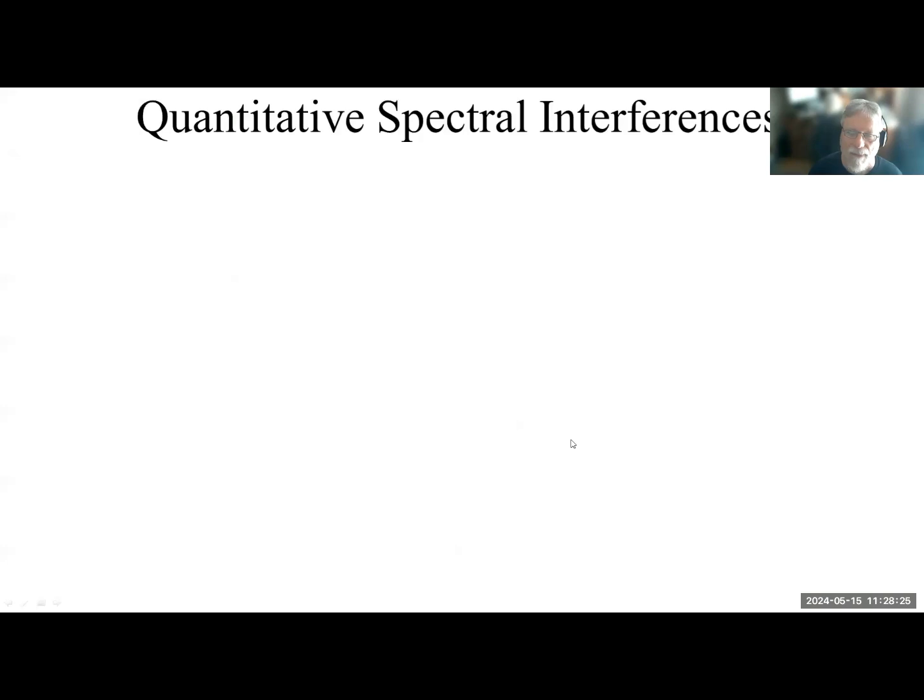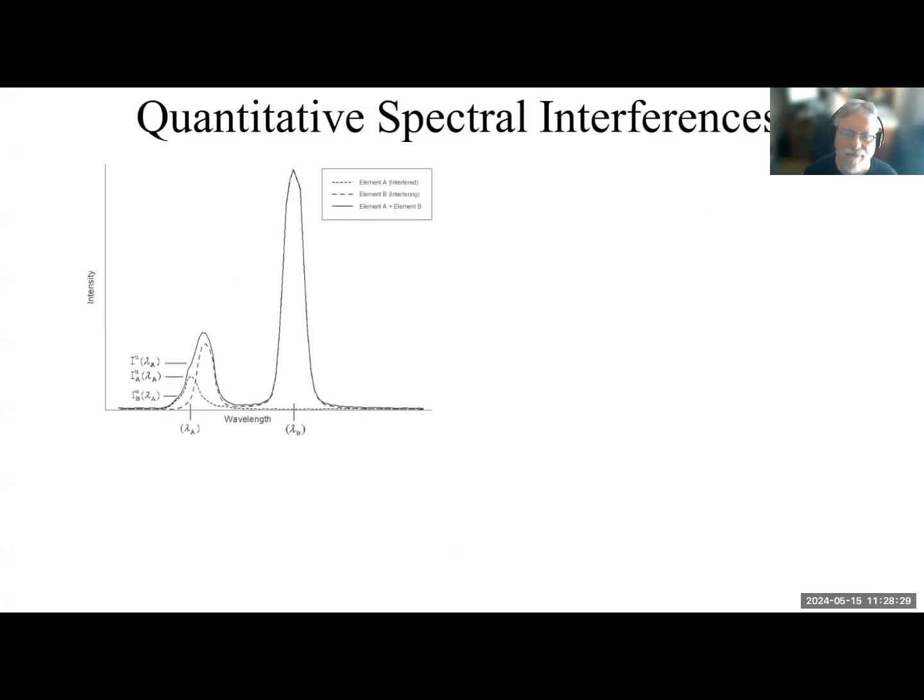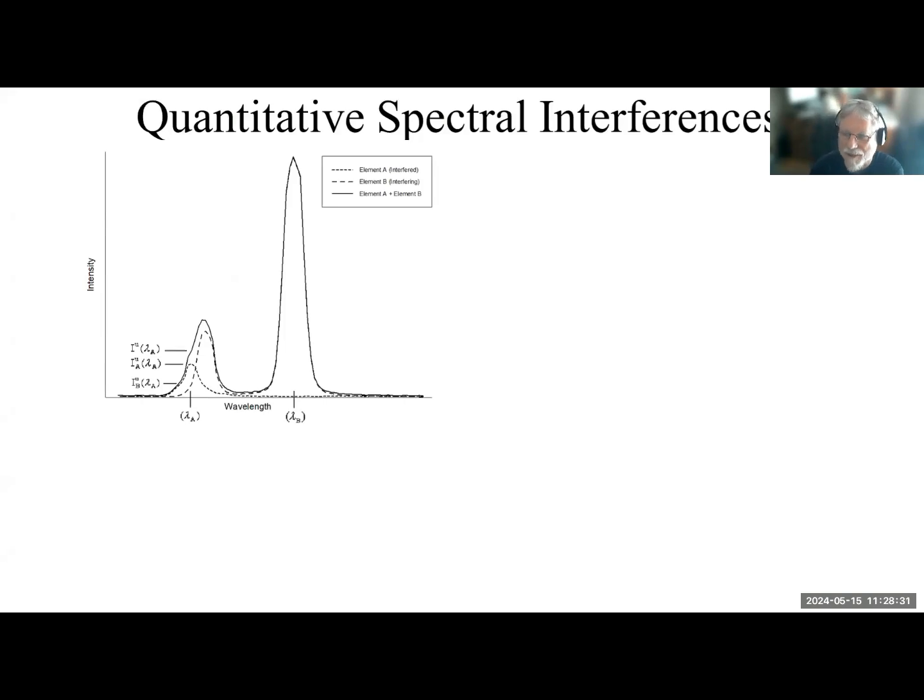All right. Did I do everything I wanted to do? Yeah. Okay. So interference corrections. This is something we started back in the 90s. People weren't doing this right, so we said, let's deal with it. And basically, it turns out this can be fully quantitative. The interference correction should not be using the old-fashioned ratio method of the intensities. You want to base it on the concentrations, because what matters is the number of atoms present, not the apparent intensity of that interfering line.